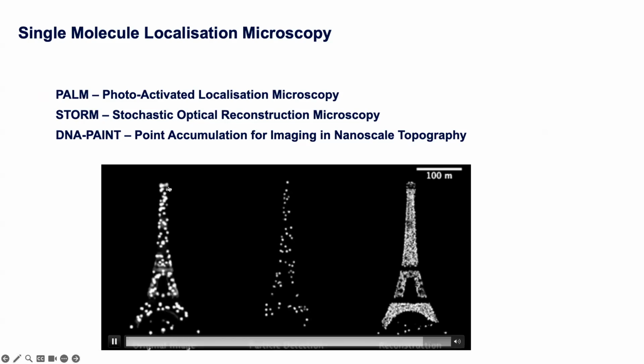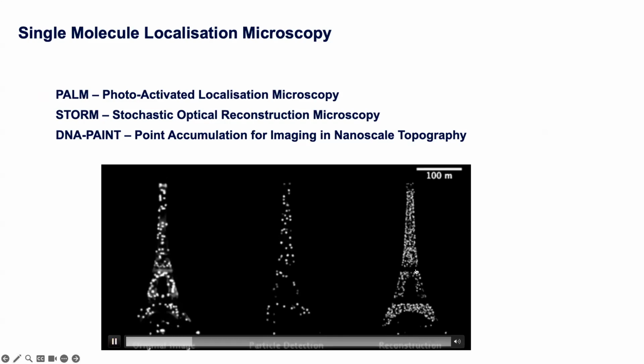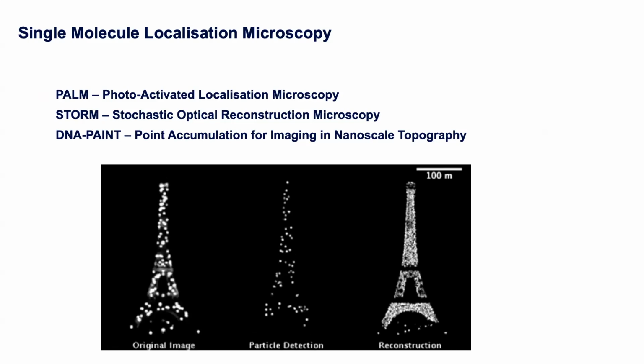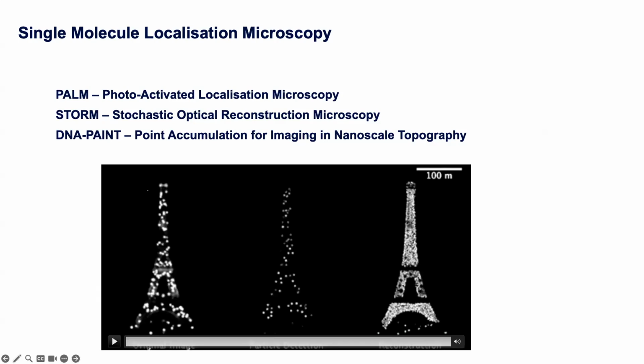So we have our diffraction limited spots here. If they are sparse enough, then we can be sure that, say, this light here is coming from a single emission event. We can actually then fit that and place a kind of central point against that molecule. And then over time, we can build that up to produce a higher resolution image. Okay, so it takes a long time to build up single molecule data. And the real key here is how do we make that blinking effect?